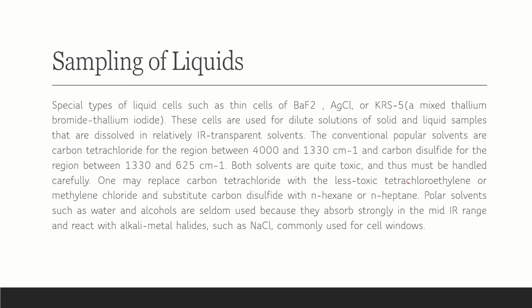Now we are using less toxic solvents, that are tetrachloroethylene, methylene chloride, or n-heptane. Water and alcohols are not used for sampling because they absorb strongly in the mid-IR region, and they react with alkali metal halides that are commonly used to prepare the pellets or the cell windows.